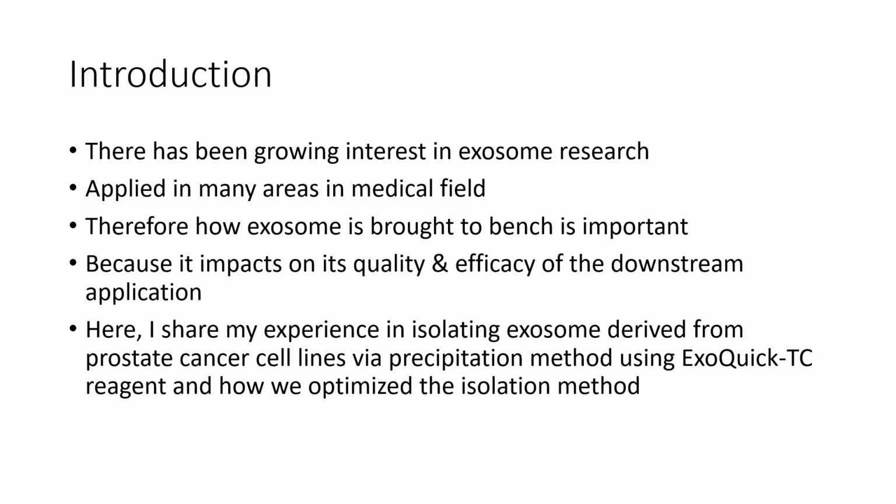There has been growing interest in exosome research worldwide. Exosome is applied in many areas in medical field, partly to be alternative to current diagnostic protocol, treatment in diseases, and disease monitoring purposes. Therefore, how exosome is brought from its original biological nest to bench is crucially important because it impacts on the isolated exosome quality and efficacy of the downstream applications.